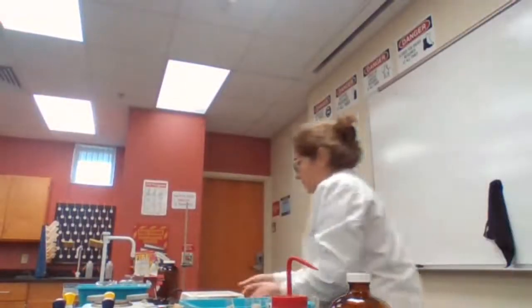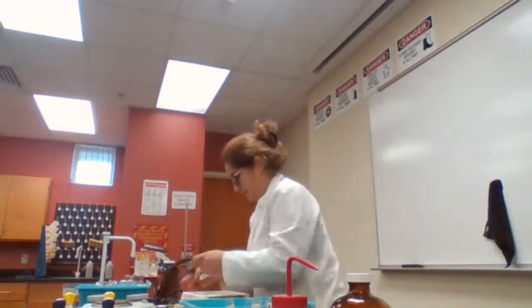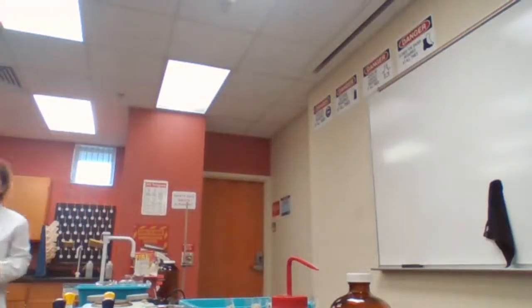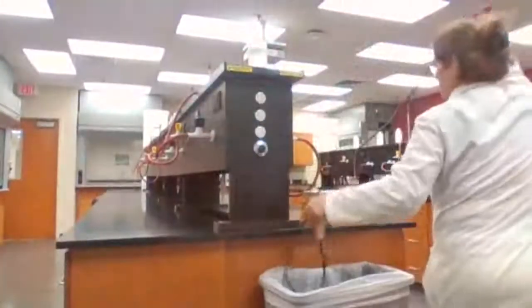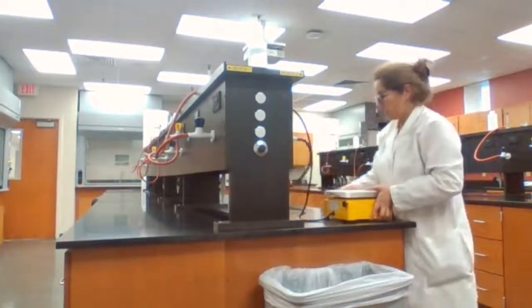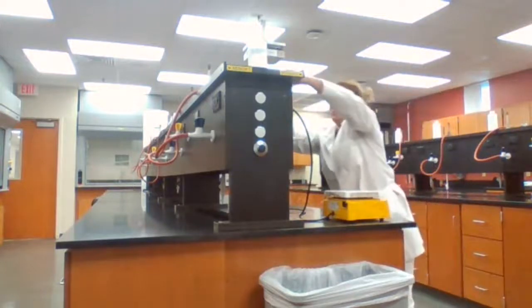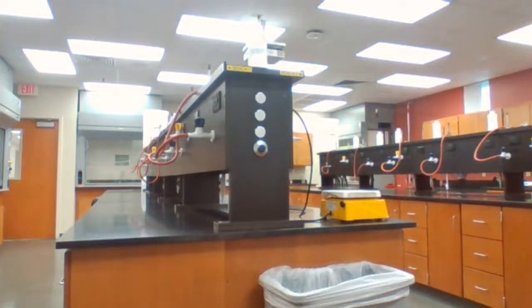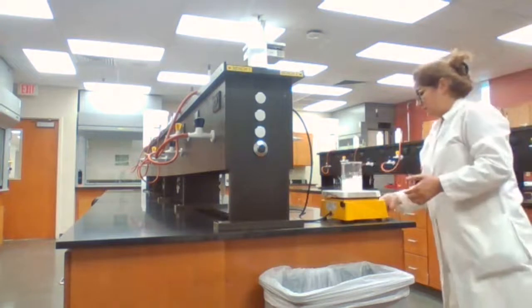So, with the first part of the experiment, ester. I'm going to start the hot water bath.